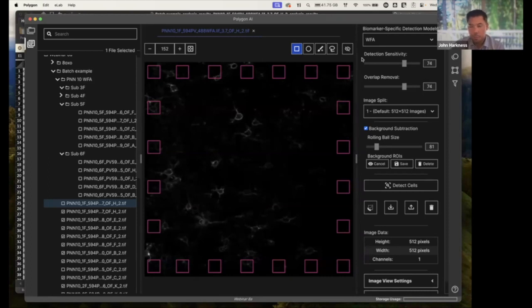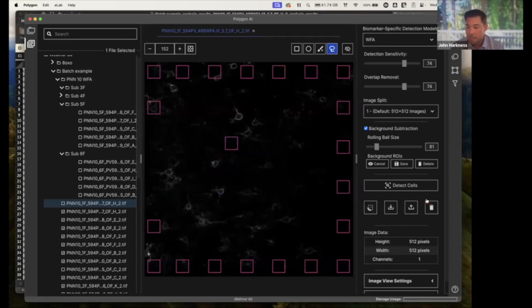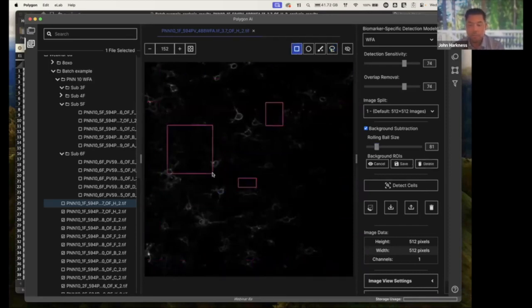But one of the really nice things to show here is that I can select some of these ROIs and I maybe can move them or I could delete them if I don't like them. This is where I could go in and maybe just draw my own background sections if that's what I'm looking for.